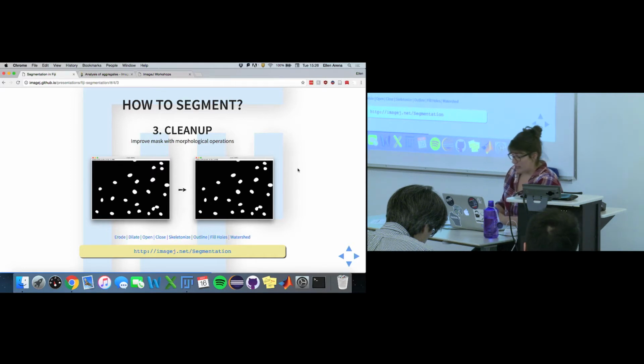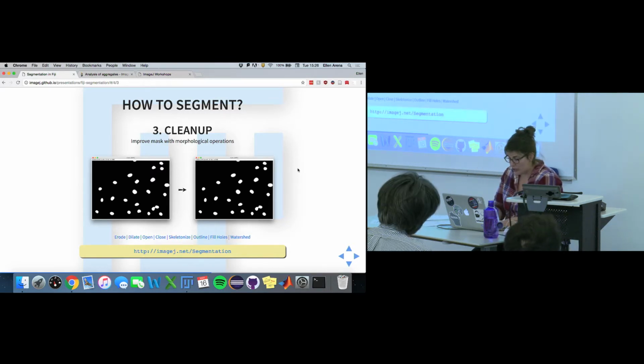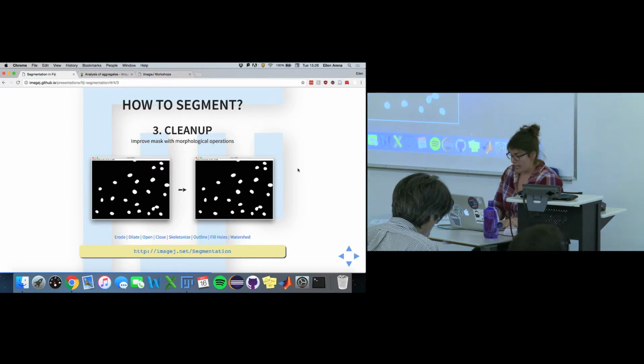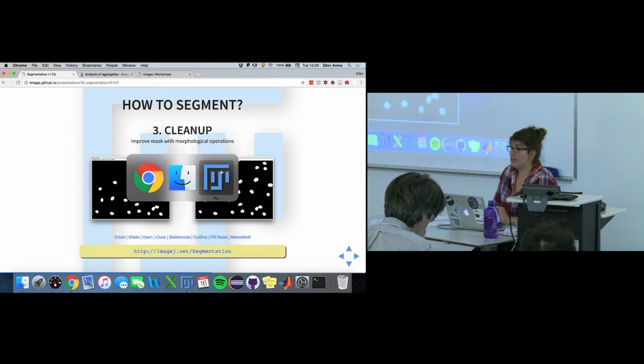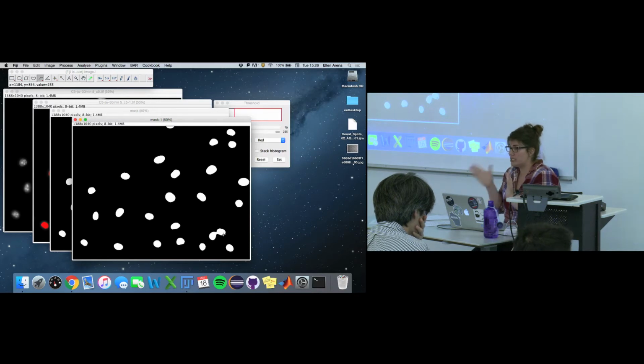And then there's watershed. So that's what we're going to use today. Watershed is used to separate closely touching objects. If you look at your image in the bottom right-hand corner, you'll see there are 2 nuclei that are kind of molded together, right? But they should be 2 separate objects. So we're going to use watershed to separate them.